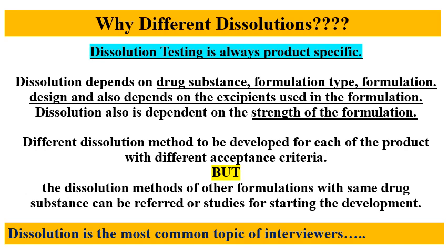That's why every formulation has different testing conditions for the dissolution test, because we cannot check different formulations with the same method. Dissolution testing is always product specific. That means every formulation has some different testing requirements.